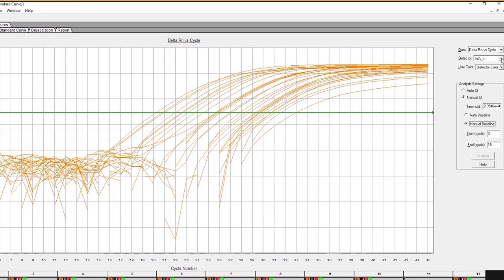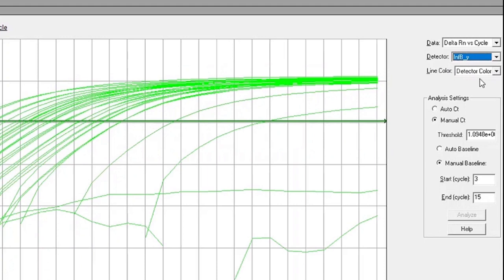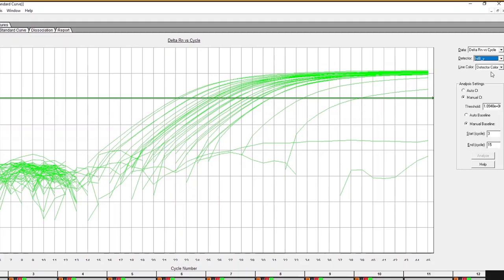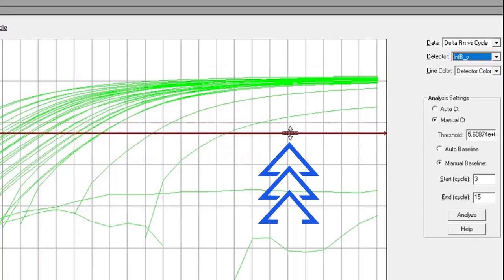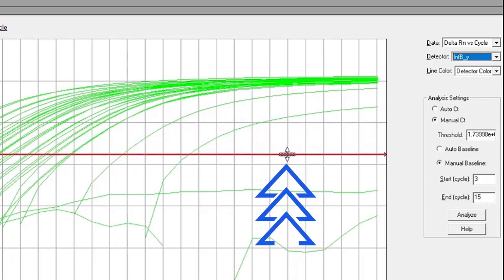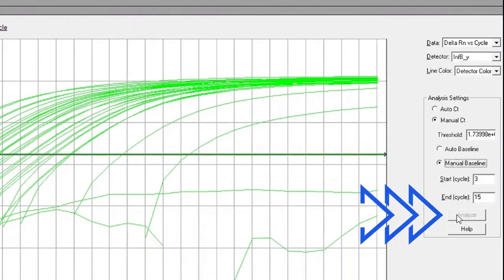To analyze the Influenza B assay, select the INF-B detector in the drop-down menu. Just like the Influenza A assay, click and drag the red threshold line until it lies within the exponential phase of the fluorescence curves and above any background signal. Then click the Analyze button.